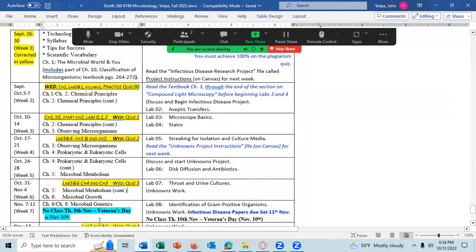All right, today is October 31st, and we're supposed to be covering Lab 7, throat and urine cultures. Hopefully, either during this lab or after the lab, I'll get you the first results for the unknown project.